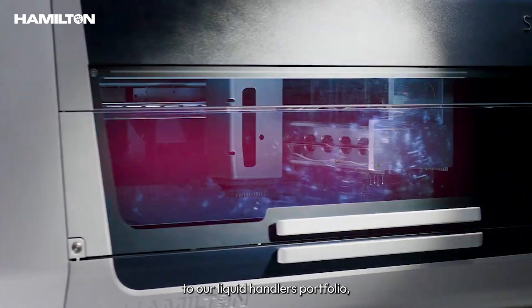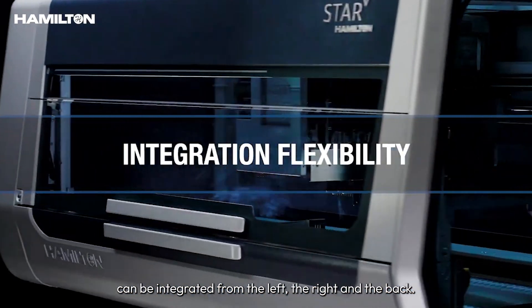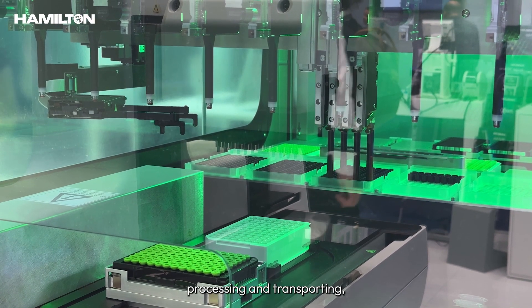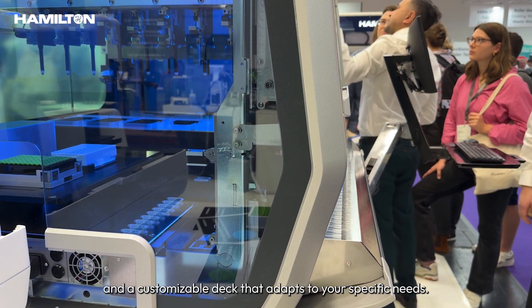The Star V, the latest addition to our liquid handlers portfolio, can be integrated from the left, the right, and the back. It features a multi-use arm for pipetting, processing, and transporting, and a customizable deck that adapts to your specific needs.